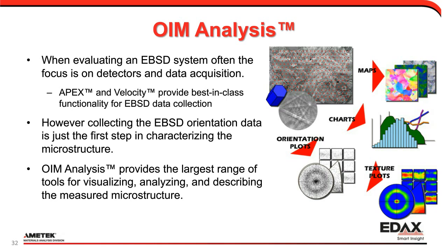There are also buttons that can be user-defined for individual maps, individual plots or charts, also partition and data set based buttons. And I'll describe a little bit what those are as we go forward. But users can add custom things to this toolbar. There's access to what we call confidence index standardization. This is a common processing step we use that doesn't change any of the data, that helps extract the most reliable data. And then it adds access there to our template list for easy access to templates.